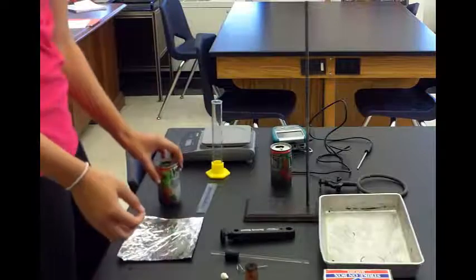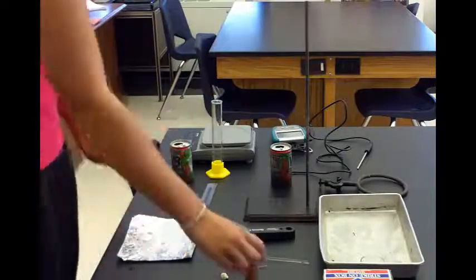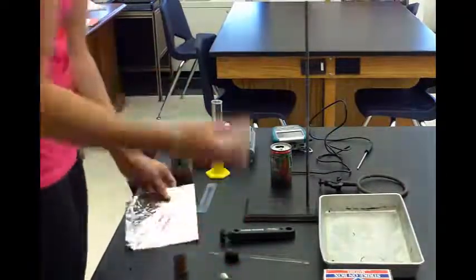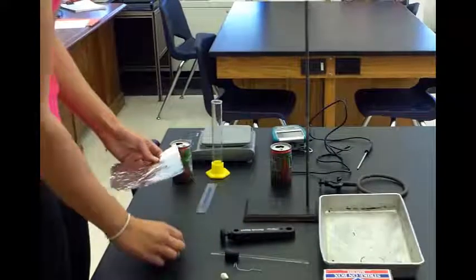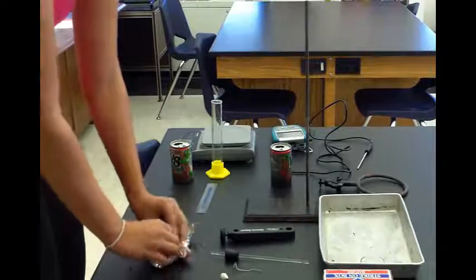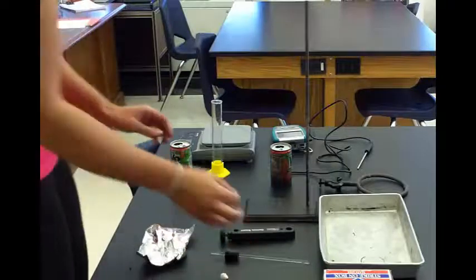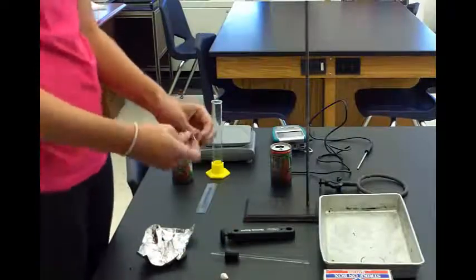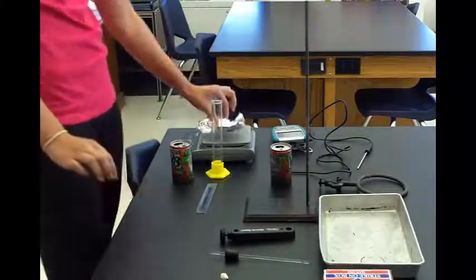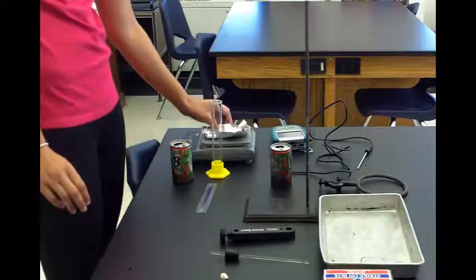Now you're going to put your food holder together. After recording the weight of your can, take your cork, foil, and paper clip. Put the cork down on the table, then push the foil around it. This makes a food holder so that if your food drops, it can catch it. Then take your paper clip and stick it in the top.